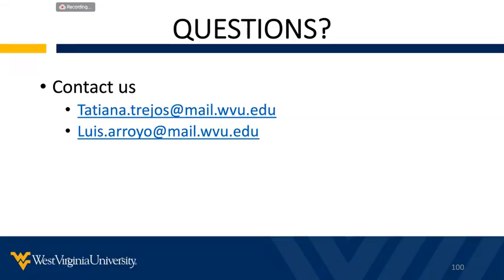But unfortunately, we don't know of an existing gunshot residue standard that has the particle shape and morphology for the organic portion. We are working on developing our own for the inorganic so far. But this is a very important issue in general: GSR standards are lacking. So that's something that we are trying to develop, to provide a solution for the community.